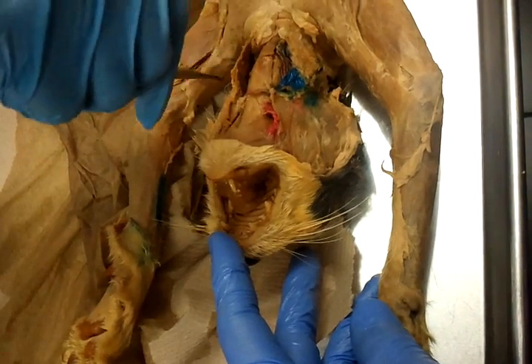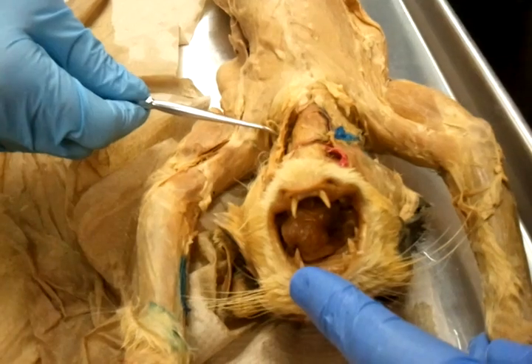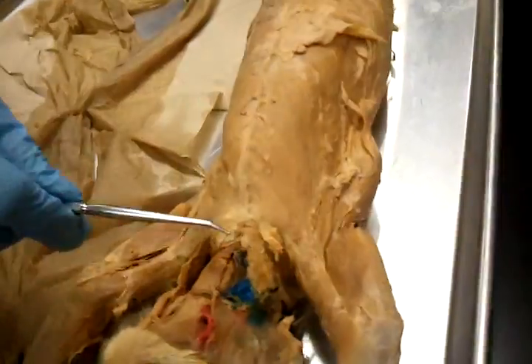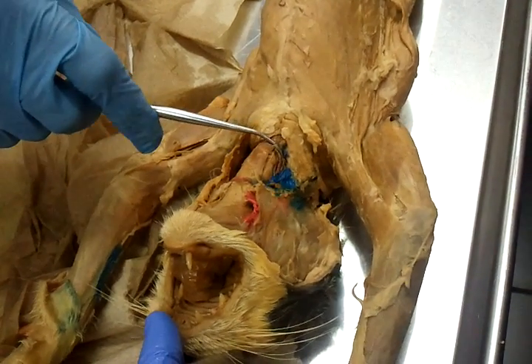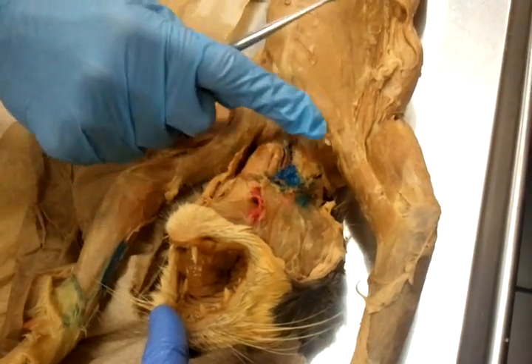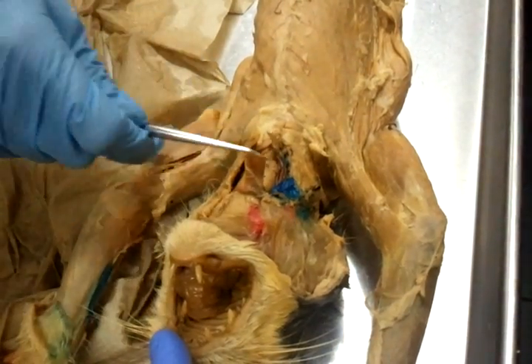Over here by the neck, in this part, this outer almost superficial muscle is your sternomastoid. And then here, most superficial and anterior, you have this muscle going from the sternum to your hyoid bone — sternohyoid. As we reflect the sternohyoid, we expose the ones deep to it.